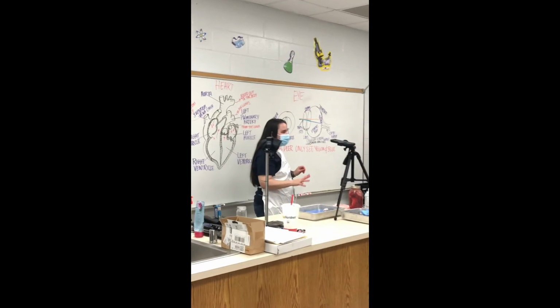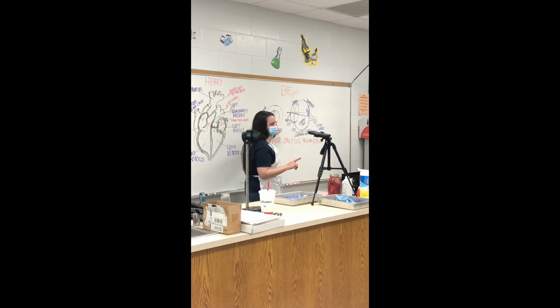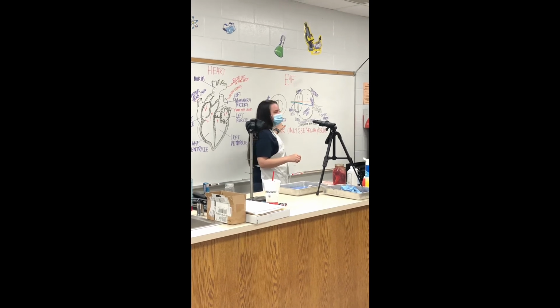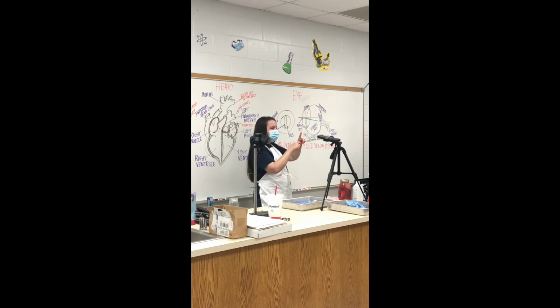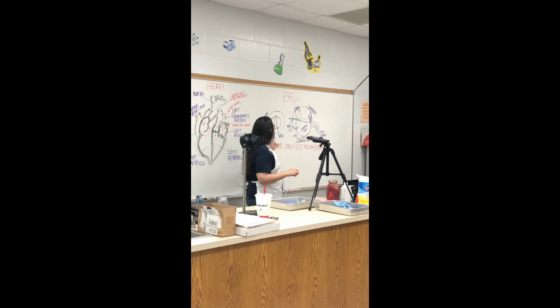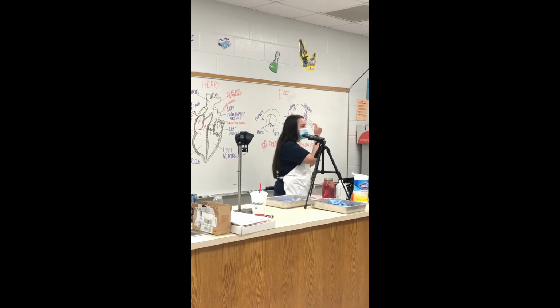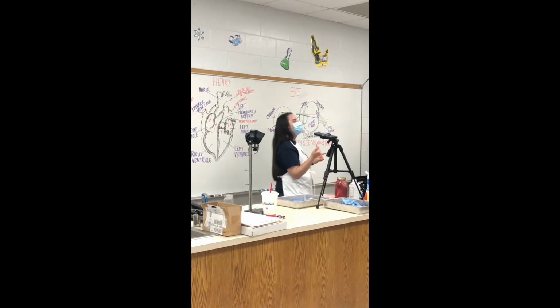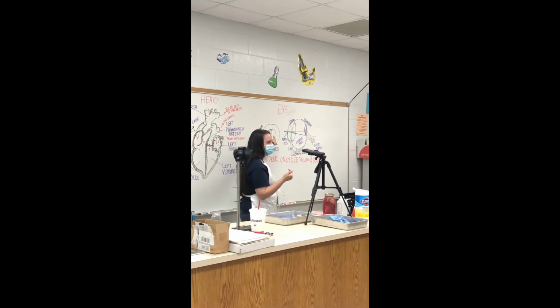It's not that much different, but there are some notable differences, like the shape of the pupil, which you'll see in a minute when I put it on my finger. The shape of the pupil in a deer looks kind of like a slit or an oval opening. In a human, if you look at your neighbor's eye, don't get too close, but you'll see this black circle, and it's a perfect circle. That is your pupil. So it's a different shape altogether.